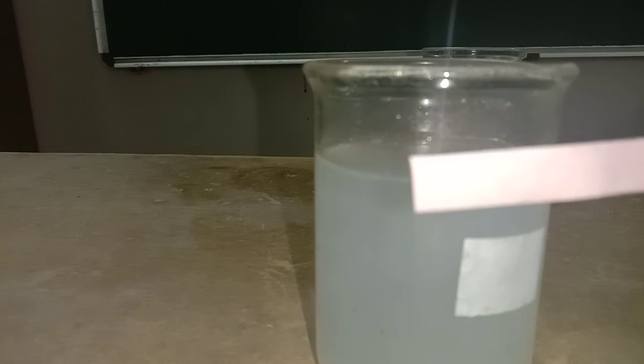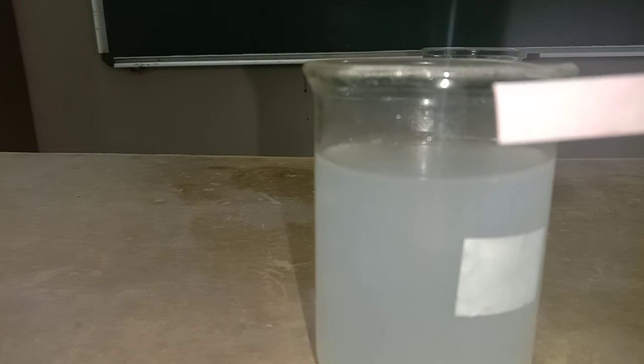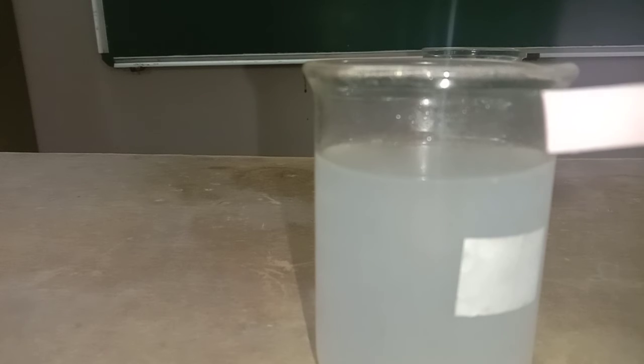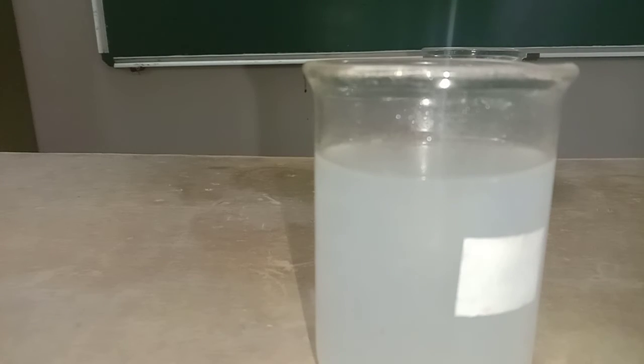We can prove the formation of sodium hydroxide with litmus paper. This is a red litmus paper in front of you. We know what will happen to the red litmus paper. The red litmus paper has a nature to change into blue if it is a base. We'll check it out. If it is sodium hydroxide, it will change the color from red to blue. We are going to prove it.